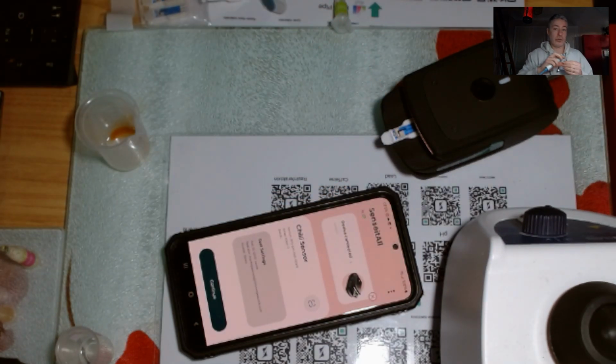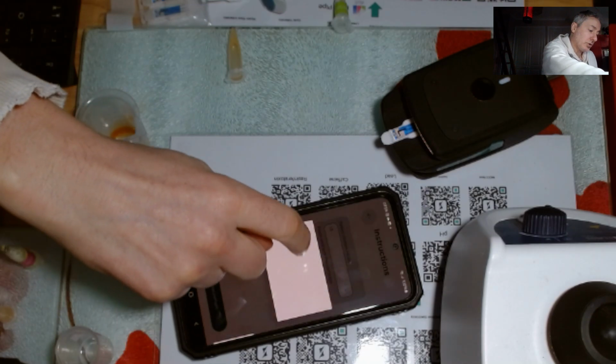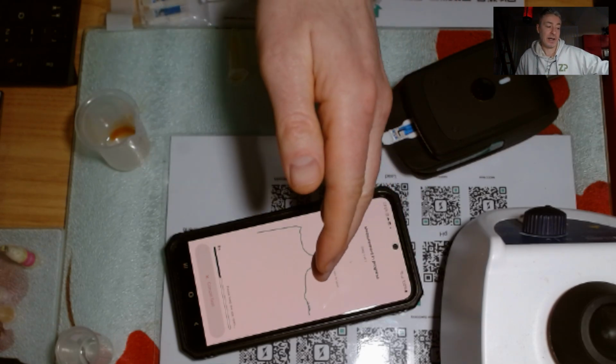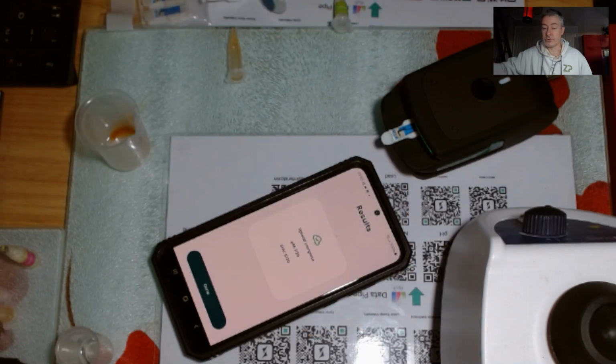All right, sample's gone on. Okay, we're in good shape there. And I will continue. Make sure I choose the 1 in 10 because it was only a 1 in 10 dilution. Then the raw signal's coming. I can see that that peak didn't flatline. Here comes the next peaks. Right, and then that's uploading, and that's come back at 5,130, which is almost perfect.